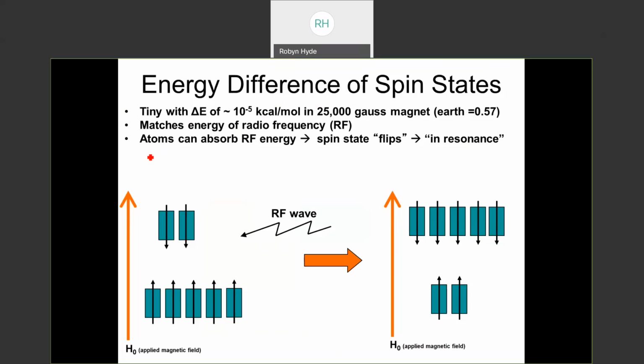So odd number of protons, odd molecular mass, then we have the property of spin. Inside a magnet, those atoms can either spin with or against an applied field. We irradiate with radio frequency waves. Some of those wavelengths will be absorbed, and we record that in an NMR plot. What happens when we absorb the energy is that we are flipping the spin into the beta spin state.